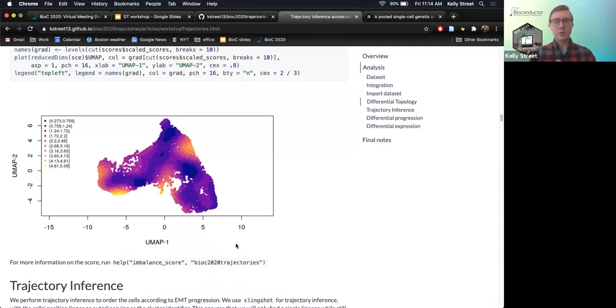And so with that information, we feel pretty comfortable fitting a single trajectory. It doesn't seem like there's any obvious distinction where being in the normal versus the treated group determines your outcome. It seems like both the start and end position is more or less the same, regardless of which treatment condition you're coming from.